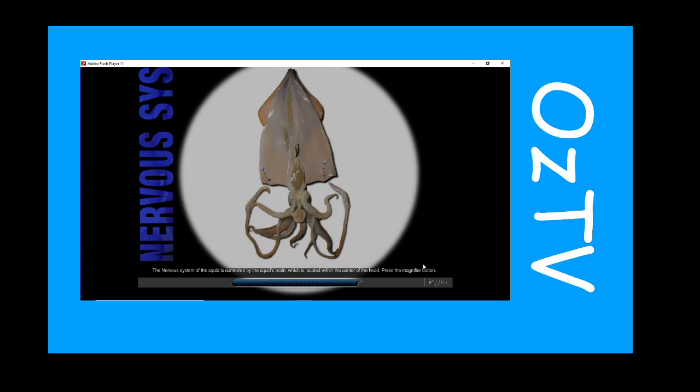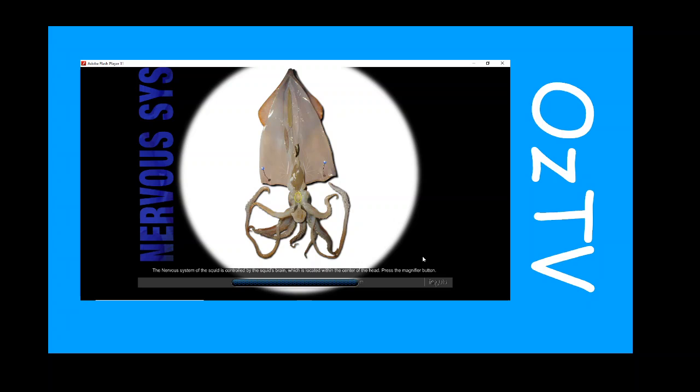The nervous system of the squid is controlled by the squid's brain, which is located within the center of the head. Press the magnifier button.